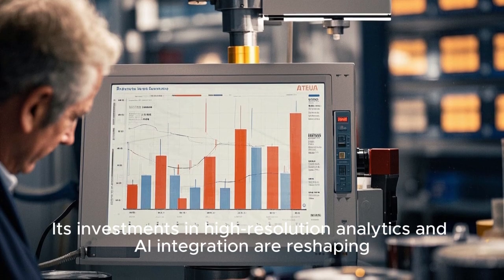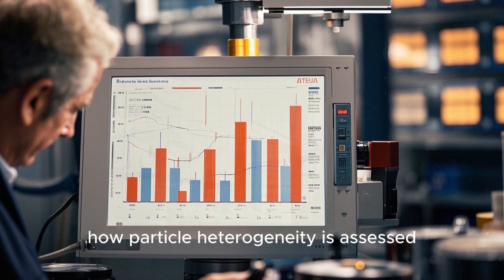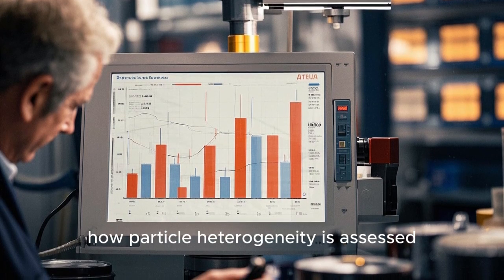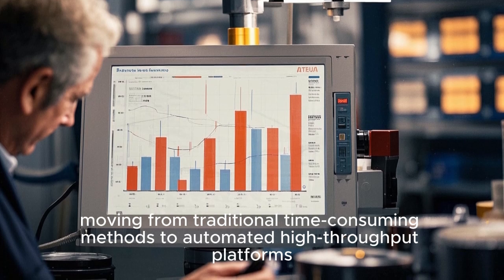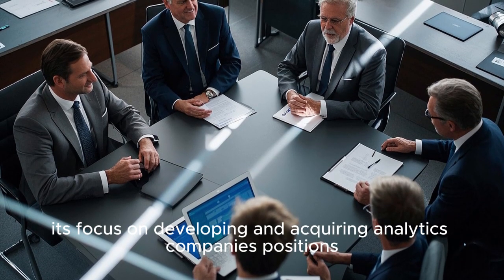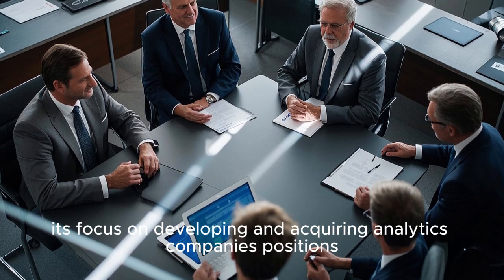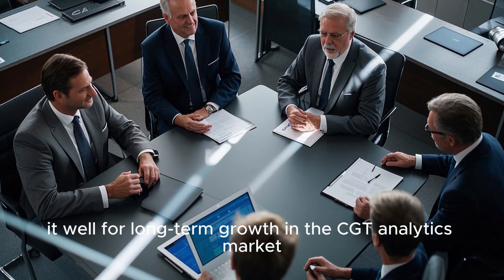Its investments in high-resolution analytics and AI integration are reshaping how particle heterogeneity is assessed, moving from traditional time-consuming methods to automated high-throughput platforms. Moreover, its focus on developing and acquiring analytics companies positions it well for long-term growth in the CGT analytics market.